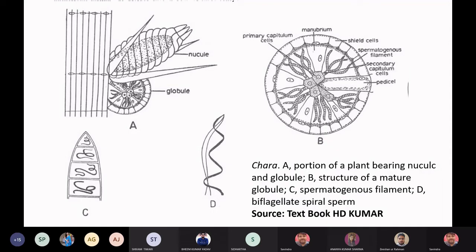जब हमें क्रोमोसोम देखने होते हैं, जब आप माइटोसिस मियोसिस करोगे ना, then we will use acetocarmine. Because here our main function is to observe those structures which are having more chromosomal part compared to any other cell structure.